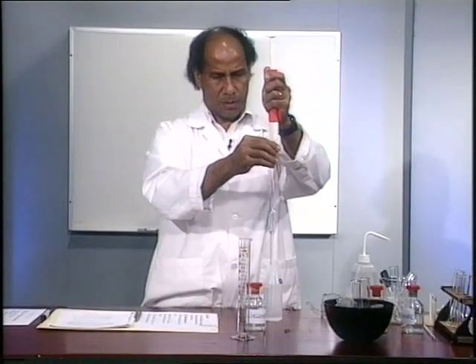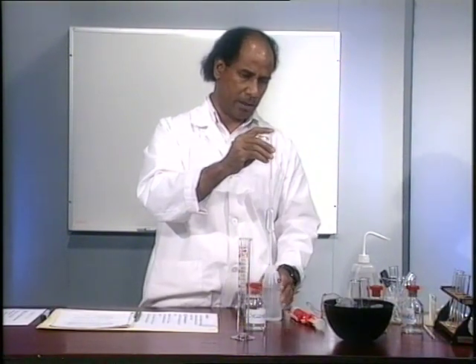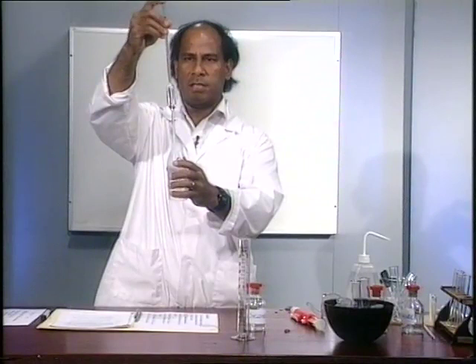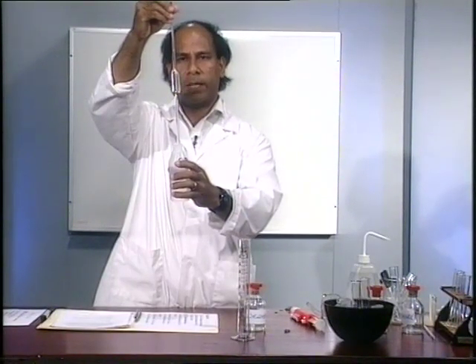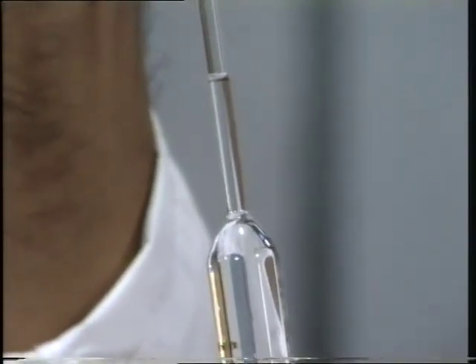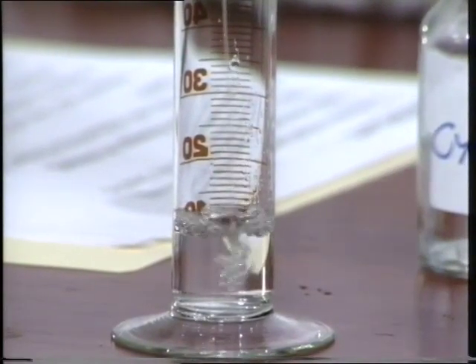So what you can do is you put the tip of the pipette at the bottom, and then slowly remove your pipette filler, and then with your finger on the tip of that pipette, you slowly take the volume or that level down, keeping your eye on the mark on the pipette. So there we are. It's there. Now you take it out here and put it in your measuring cylinder. Let it run down freely. So that is the way to pipette the 25 cm cube of water.